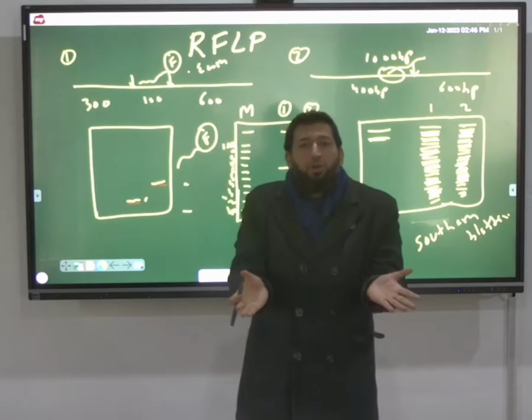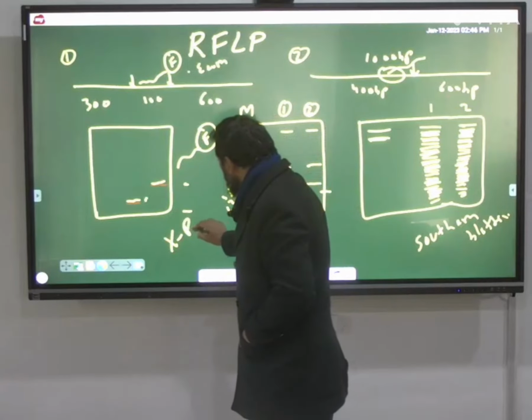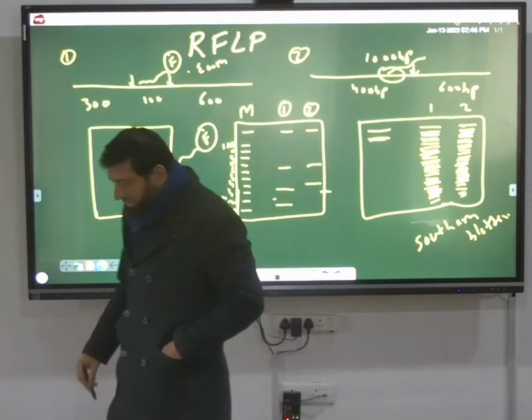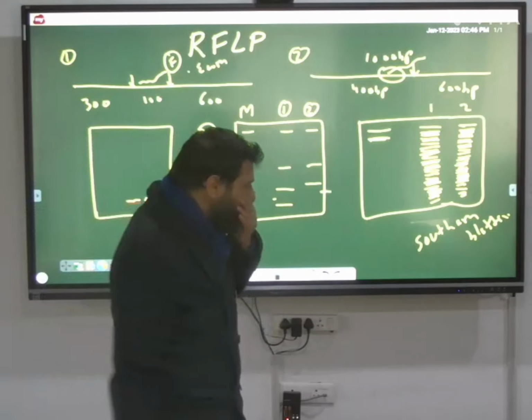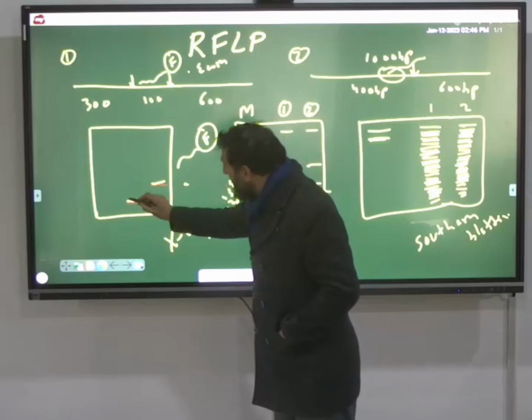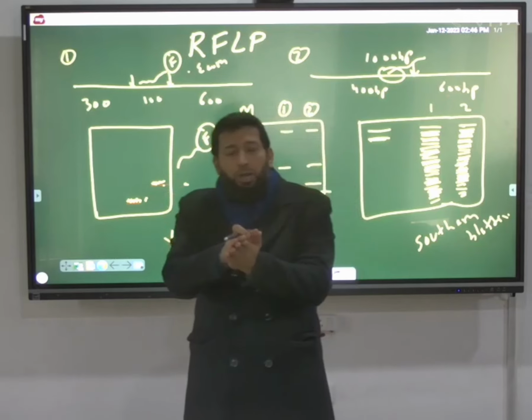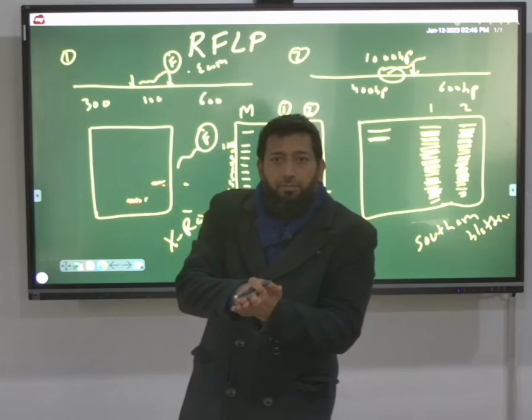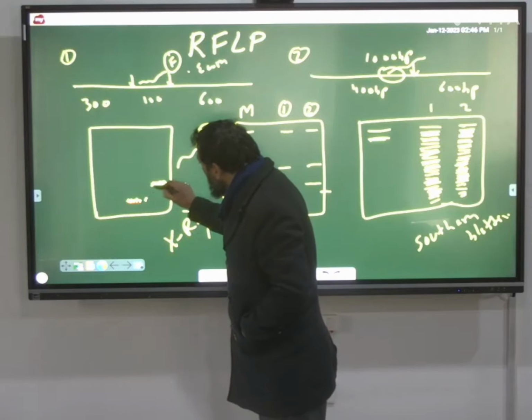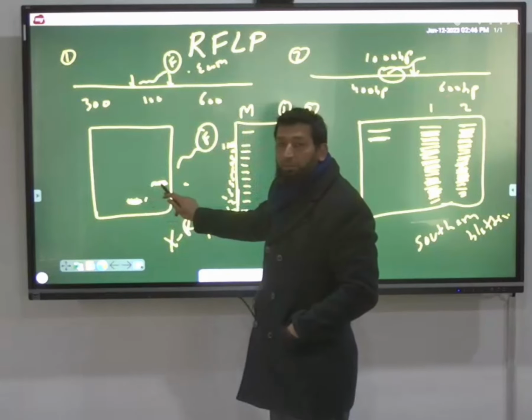Now since the probe has a fluorescent label with it, जब हम इस पर एक्सरे फिल्म रखेंगे, या फोटोग्राफिक फिल्म वगैरह, तो ये एक्सपोज हो जाएगी फ्लोरेसेंट डाई के, और वहां पर एक्सरे फिल्म पर हमें फ्लोरेसेंस मिलेगी, जो फोटोग्राफिक प्लेट पर अपना इंप्रेशन छोड़ेगी. और जब हम एक्सरे फिल्म को देखेंगे, हमें दो बैंड्स मिलेंगे, एक यहां पर मिलेगा, एक यहां पर मिलेगा.